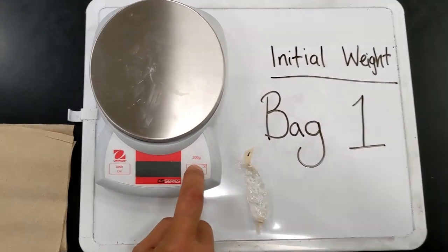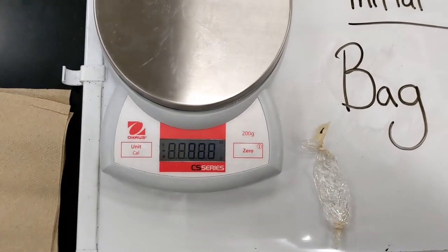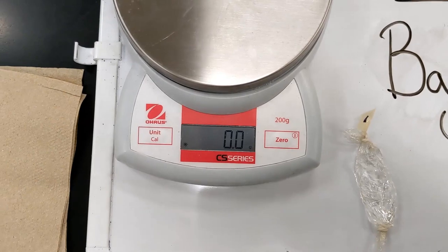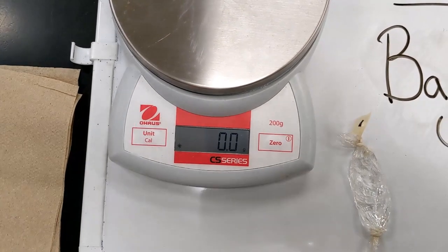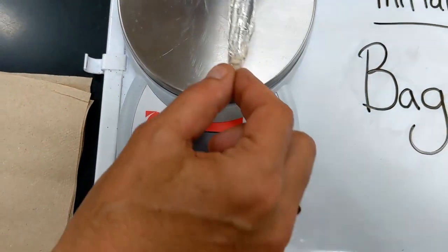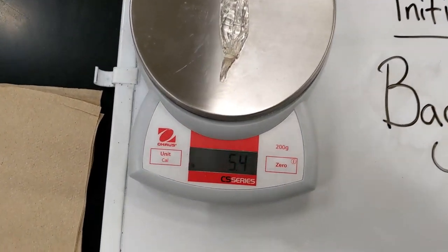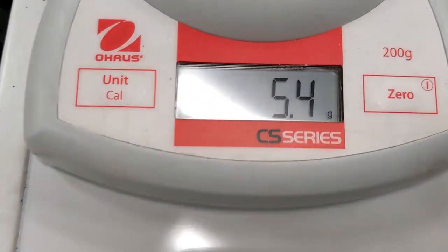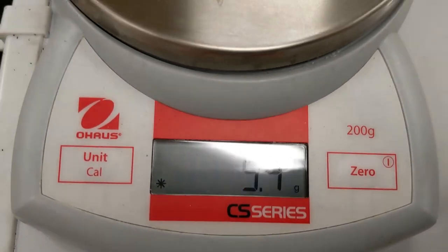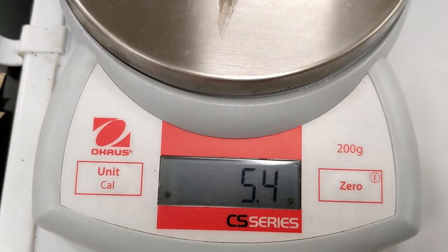Now the first thing we have to do is turn on our scale and make sure it says zero. Then we tap dry our bag and place it on there, and record the weight in grams. We will repeat this for each bag.